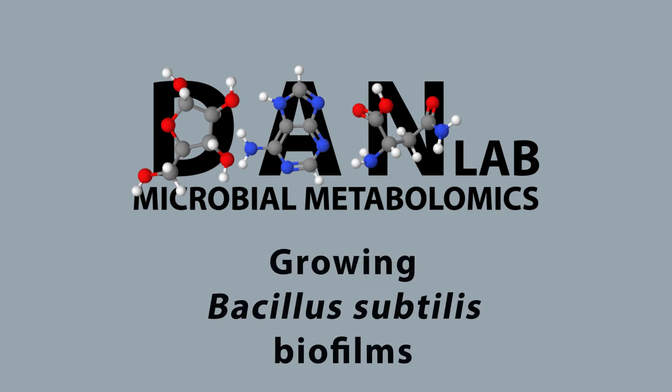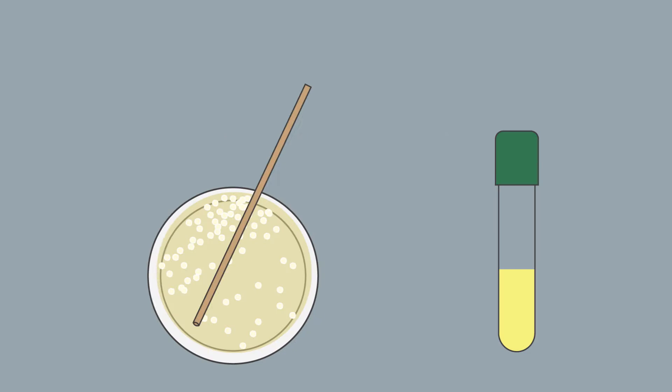Hi there, welcome to the Dan Lab. In this video, Lauren is teaching us how she grows bacillus subtilis biofilms in 12-well tissue culture plates.